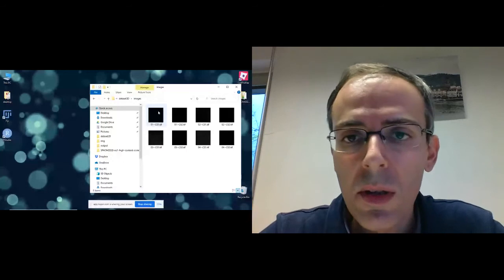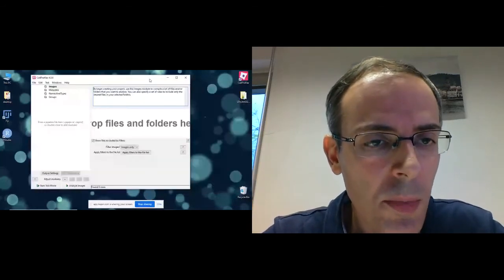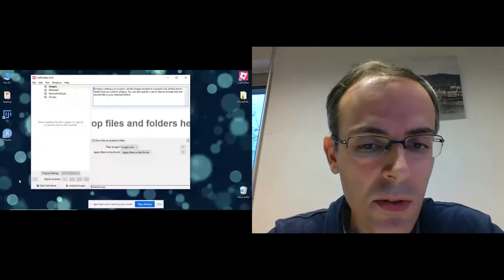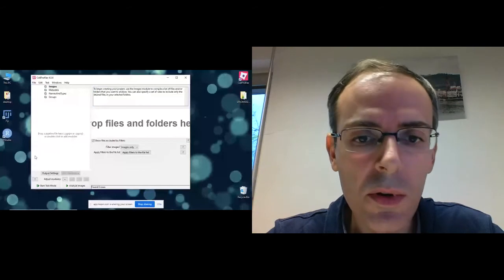On the left part of the window, we will be introducing the analysis modules that we will need to analyze the data set, and on the right we will be able to configure each option.